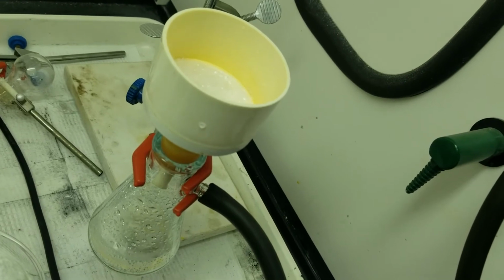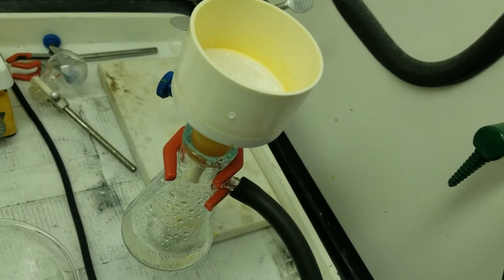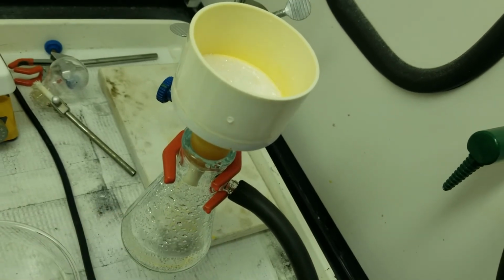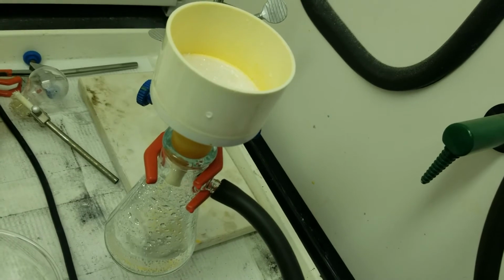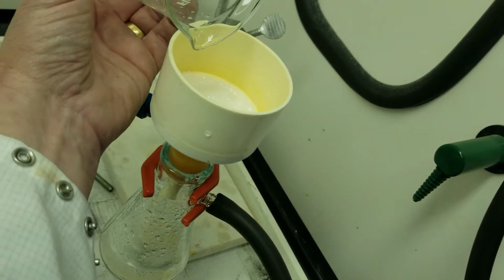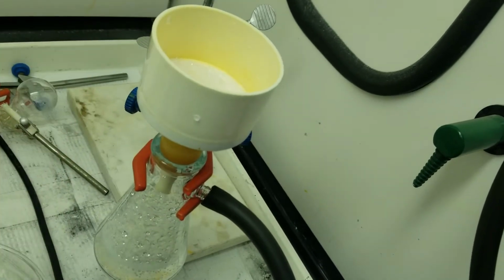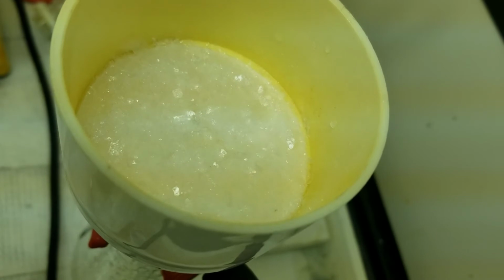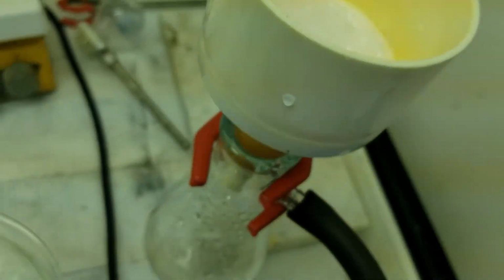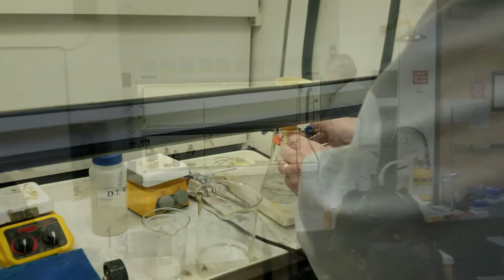Okay, so now the last step is to let this air dry. We're going to leave the vacuum on for another 30 minutes. We're just going to stop it and come back, and hopefully the water will leave our product and we'll have a really nice yield. We'll have a nice percent yield and we'll have a nice melting point.